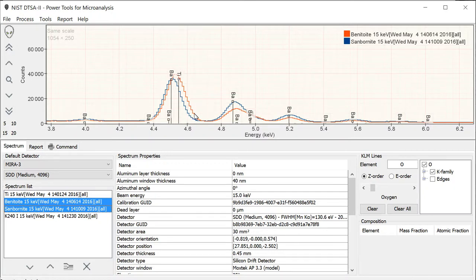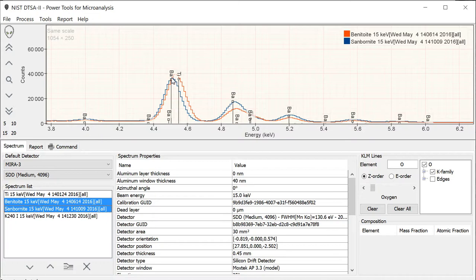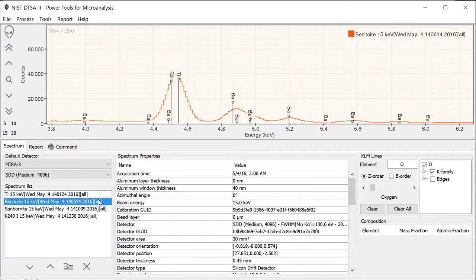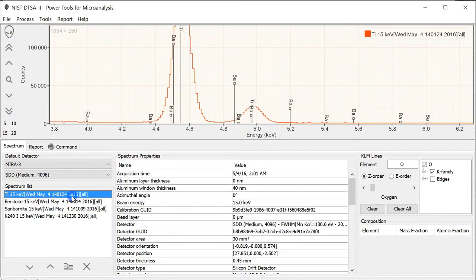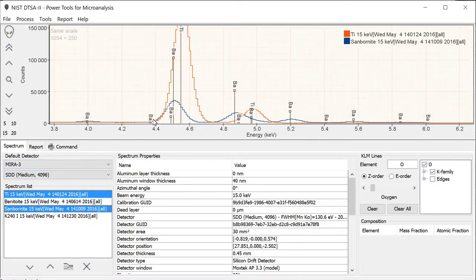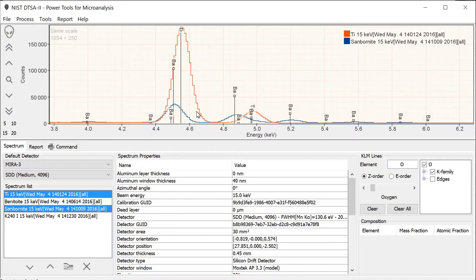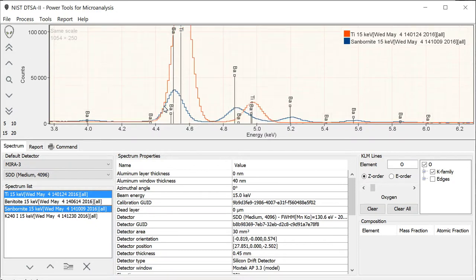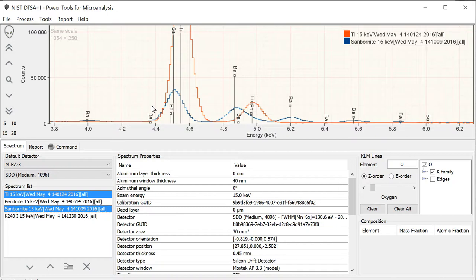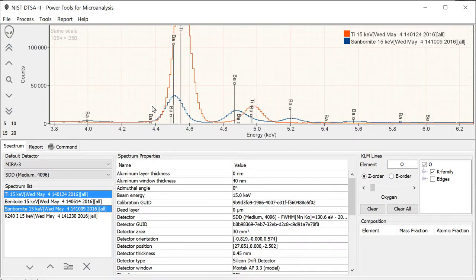We're going to call benitoite our standard, and we're going to call these other spectra—the titanium providing the pure clean titanium peak and the sanbornite containing barium in a situation where there are no interferences—we're going to call these two things peak shape references. These are good peak shape references for this particular range of energies. So we will use them. How will we use them?